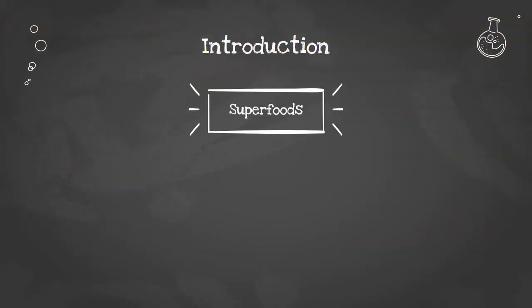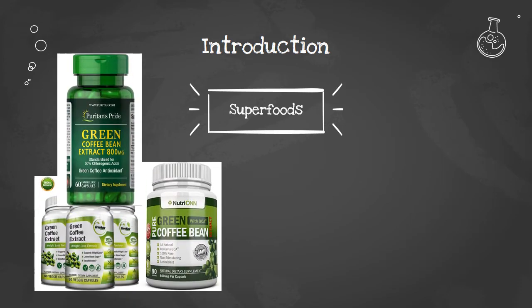Current food industry trends include the production of new functional foods, so far known as superfoods, with pro-health properties through the introduction of components with antioxidant or antimicrobial activity. Recently, green coffee has been introduced as a food supplement regarding its functional and antioxidant activity, since it contains phenolic compounds and caffeine.